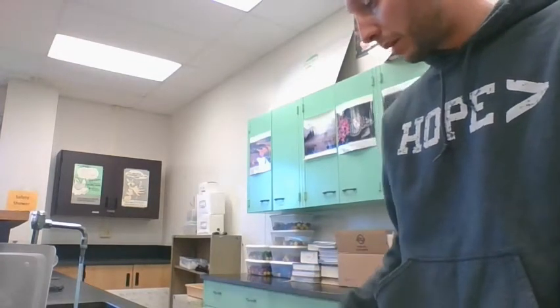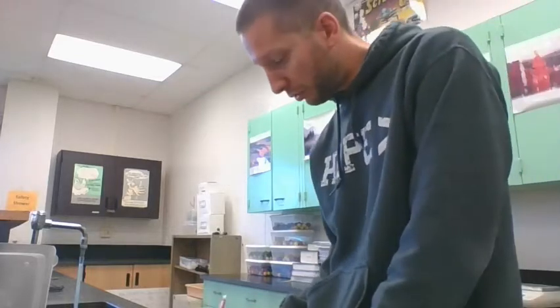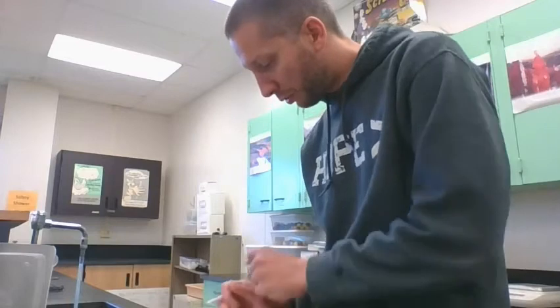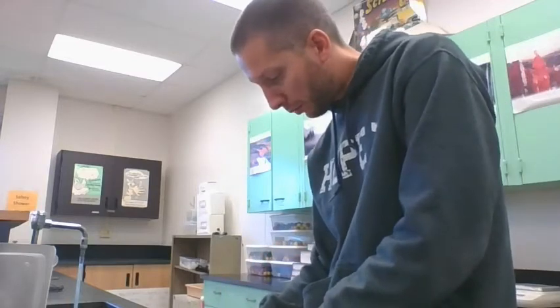And remember, our filter paper weighed 1.42. So we just need to subtract 1.42 away from what we get to see what our actual yield is. All right, so let's take a look.